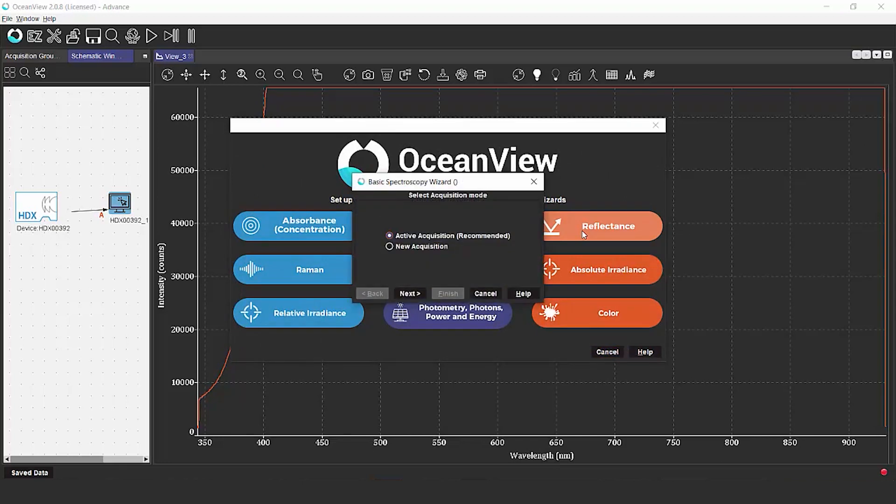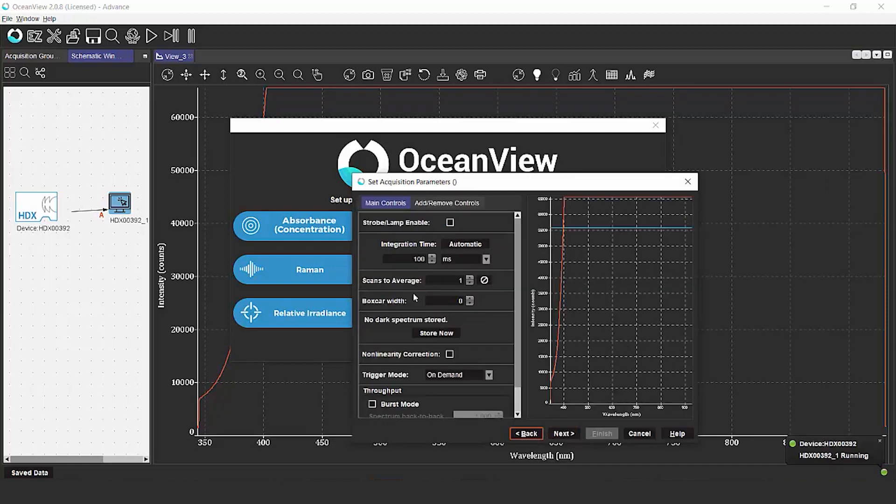So we're going to pick the reflectance option. We recommend sticking with the active acquisition, so no change is needed here, and you can just click next.